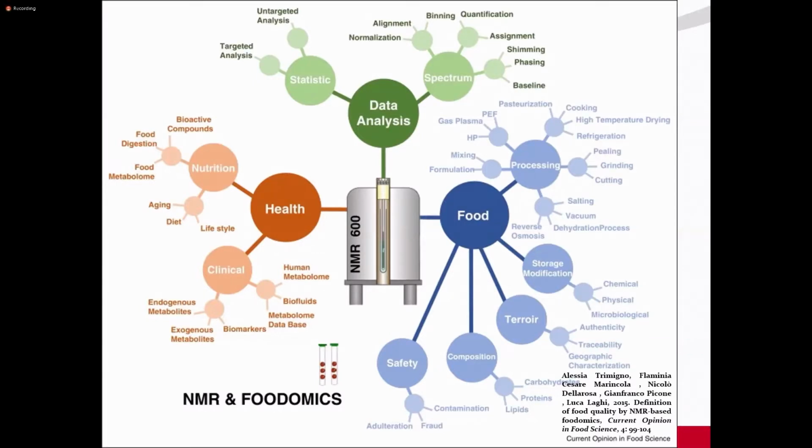So for clinical nutrition applications, such high-resolution NMR spectra are analyzed to obtain information. But for that, again, good statistical analysis and data analysis skills are required.